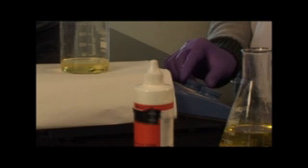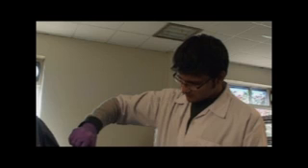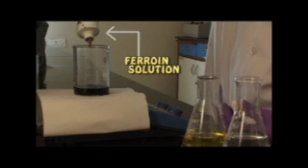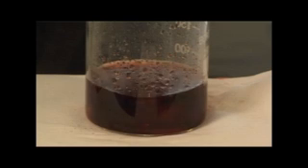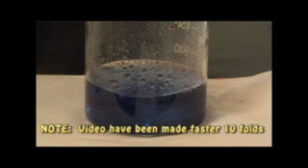The solution changes from yellow to clear due to a change in the concentration of cerium ion with 4 charges. To visualize the reaction better, add ferroin solution drop by drop till the mixture becomes red. The red solution suddenly turns blue and then back to red. This goes on and on as if it is a chemical clock.